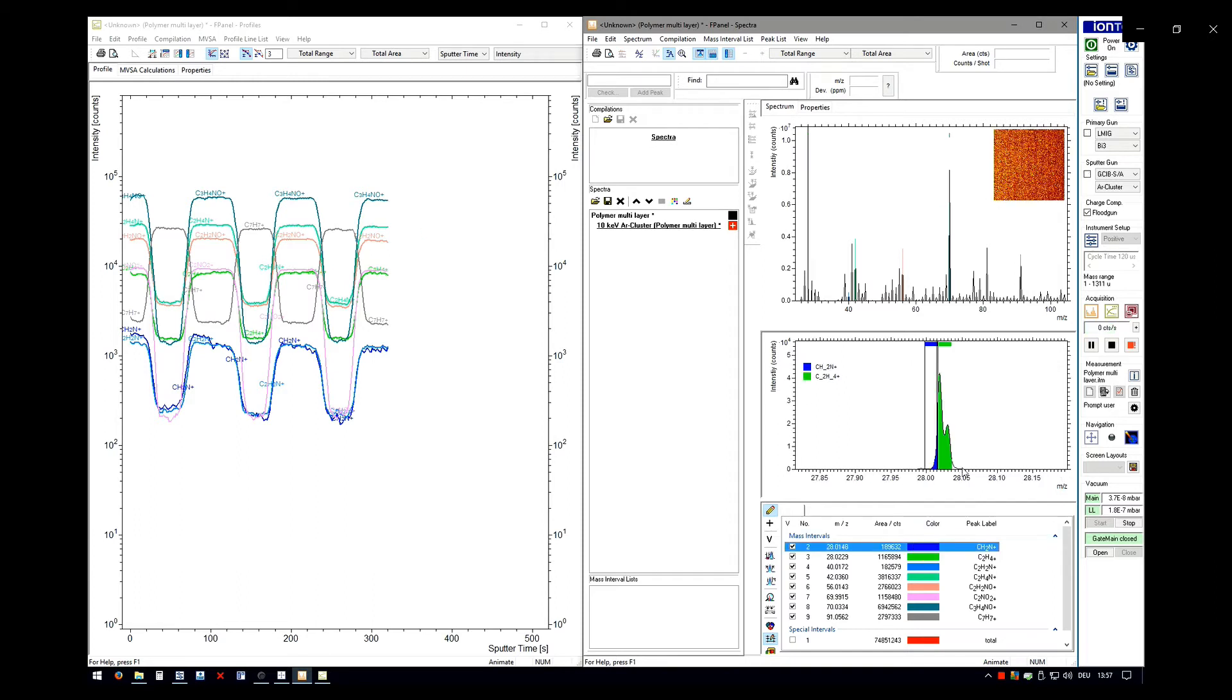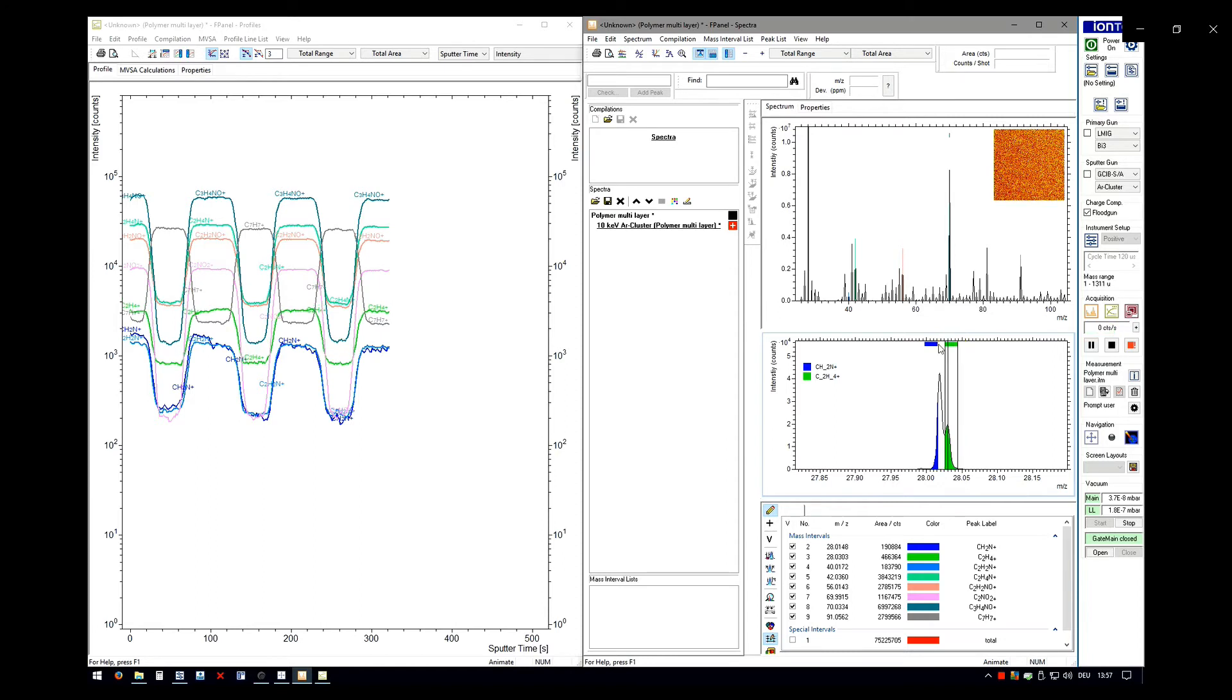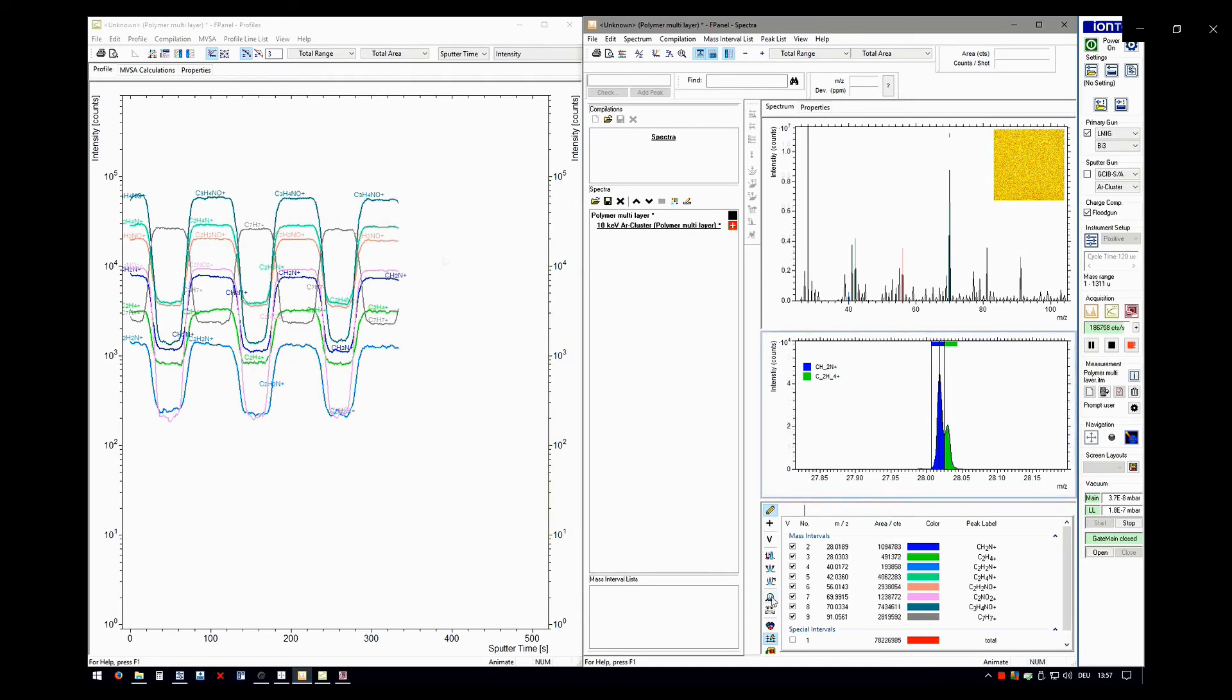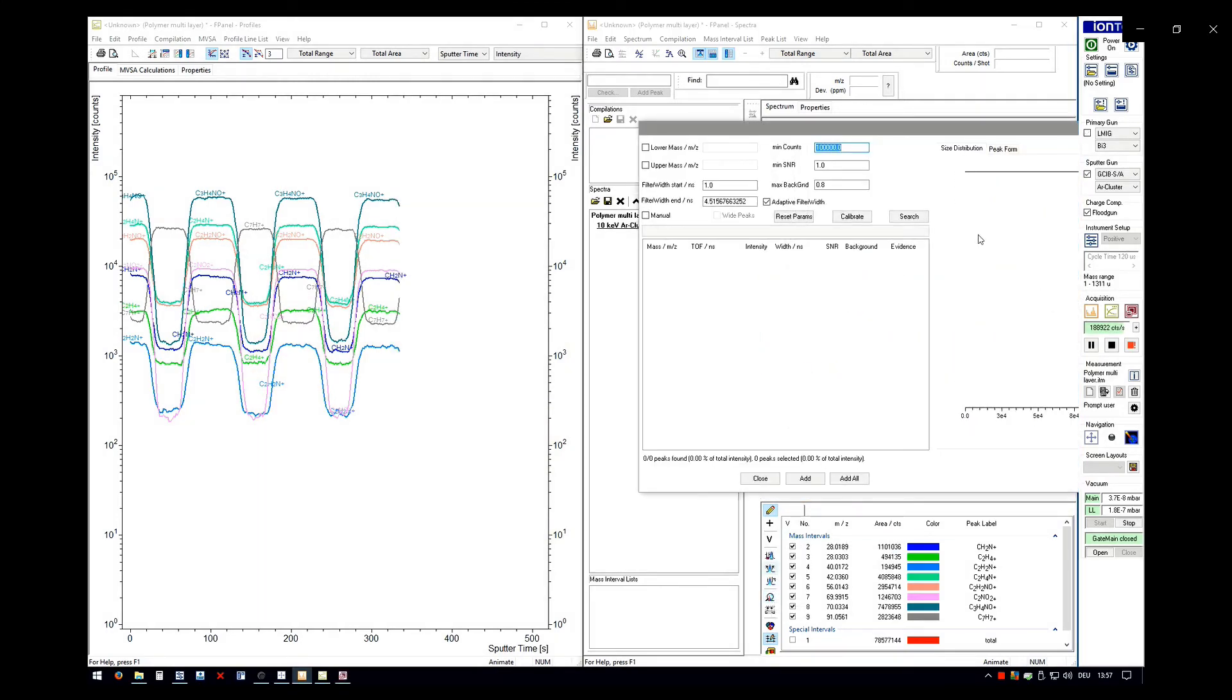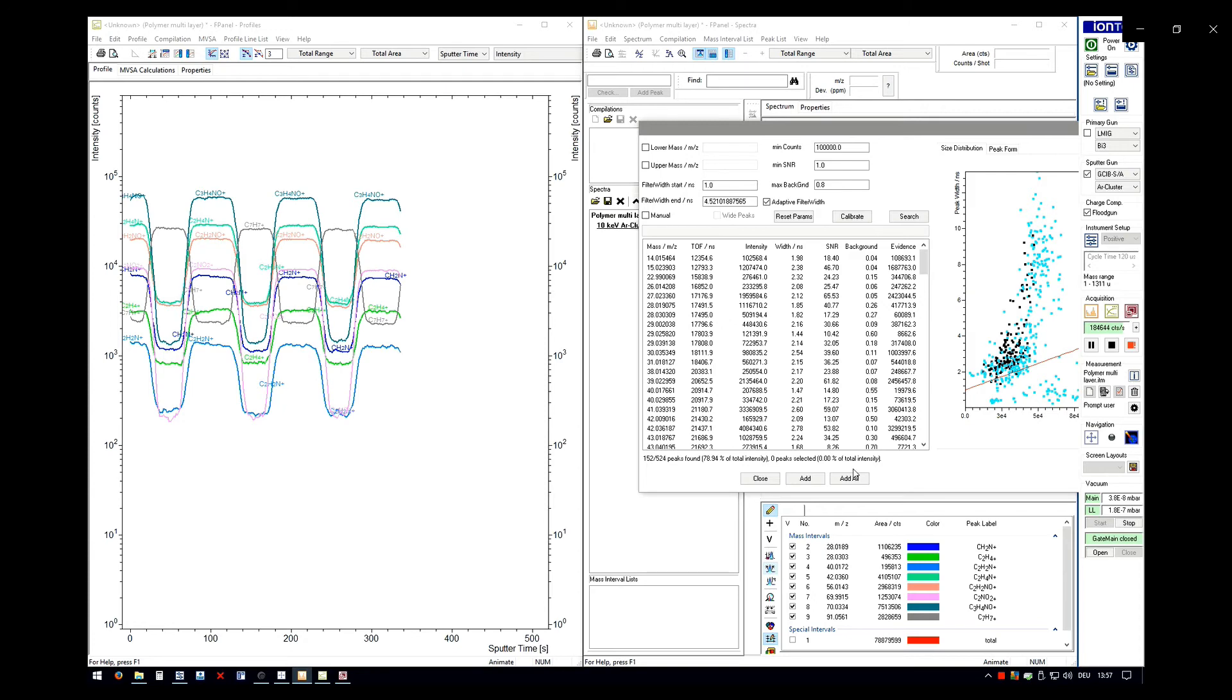The adjustment of peak margins is also instantly applied to the profile without reconstruction. The interactive data analysis shows the same performance if you, for example, add over 150 peaks at once to your peak list.